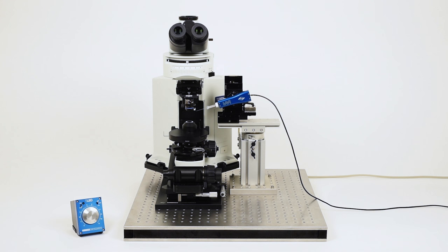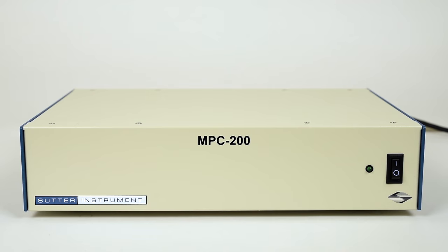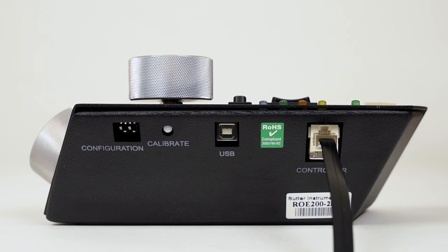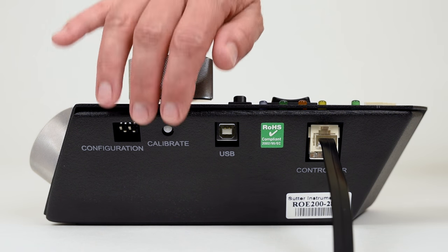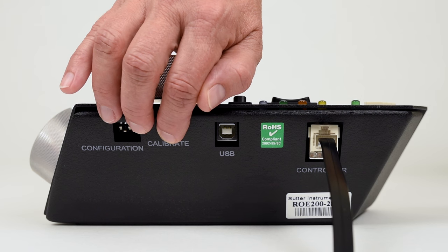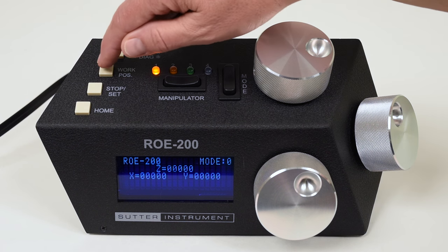To begin, position your manipulator in the center of travel on all three axes. On the MPC200, the factory set work position will be approximately in the center of travel. After connecting the manipulator to the controller, press calibrate, then press work position.